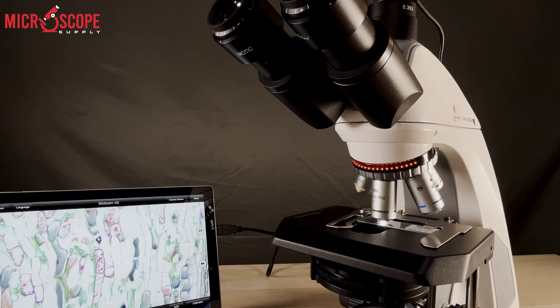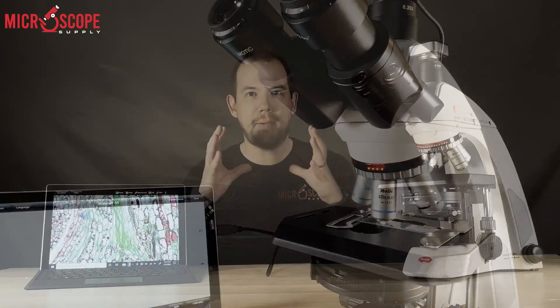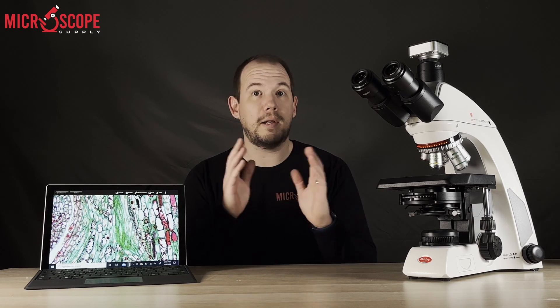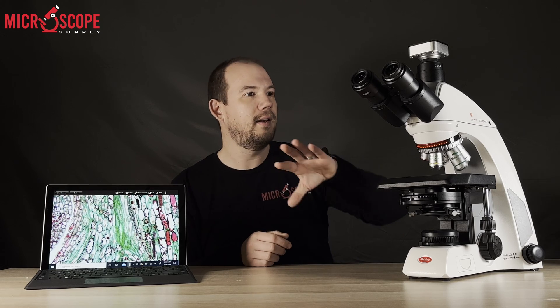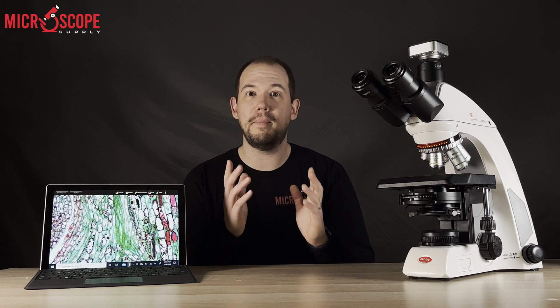When you move from a low magnification objective to a high magnification objective, there's a very big difference in the light intensity needed to be comfortable to your eye. So instead of having to rotate objectives and manually adjust the intensity — especially if you're working between several objectives often — the Motic C2 memorizes those settings, making for a great viewing experience and one less thing you have to do when using the microscope.